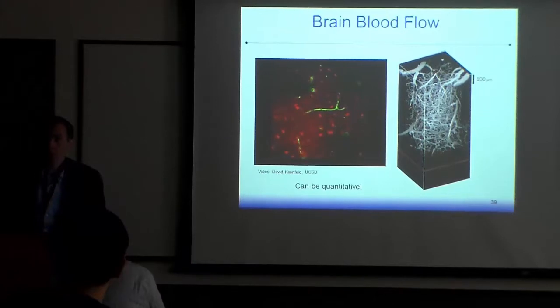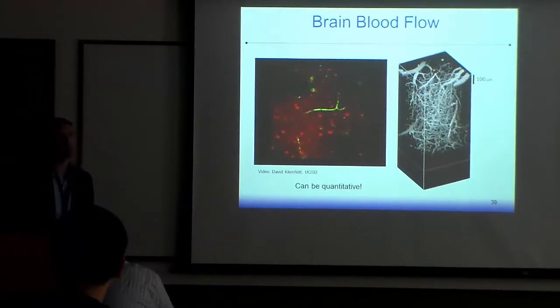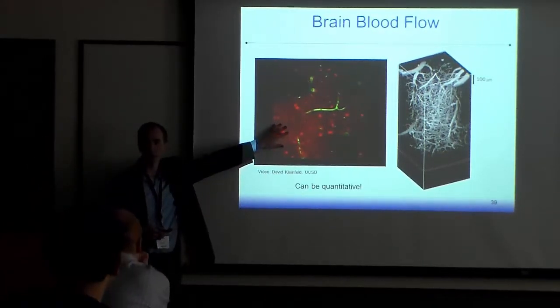Oh, what's the field of view? Or what's the imaging speed for this? Oh, sure. So this was real time. So depending on a pretty simple setup without using any type of resonant scanning mirrors, you can get a few frames per second, 5 frames per second. But if you use some special types of galvo mirrors, you can go to 30 frames per second. It then becomes a trade-off between, well, how much signal-to-noise ratio do you want over how fast you go?